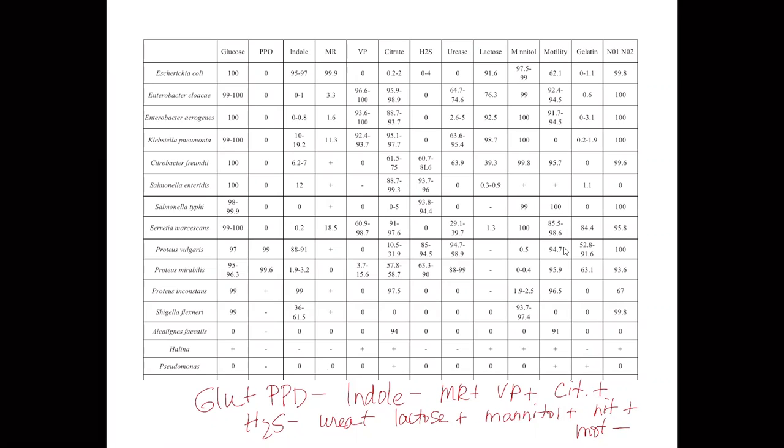and I'm going to give you in class this week. And it is, okay, glucose positive, PPD negative, indole negative, methyl red, VP positive, citrate positive, hydrogen sulfide negative, urea positive, lactose positive, mannitol positive, nitrate positive, and it's not motile.